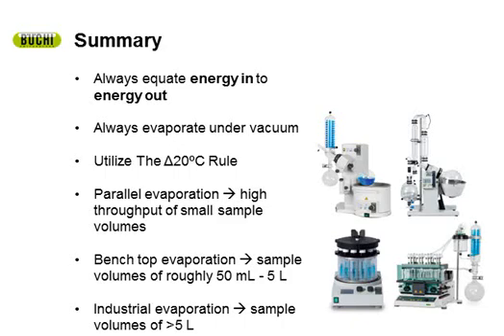I'll give you a couple minutes to vote, but the question is, when scaling up from a benchtop rotovapor to an industrial rotovapor, will the same parameters apply? A, yes, B, no. I'll give you a couple minutes to vote for this.